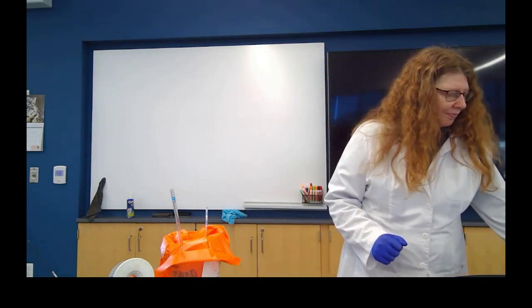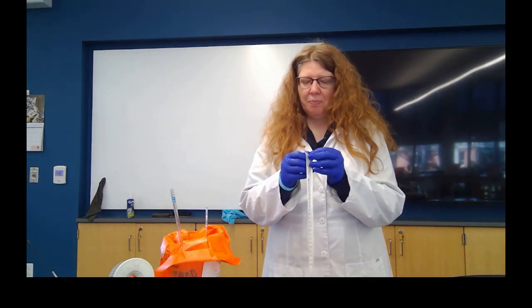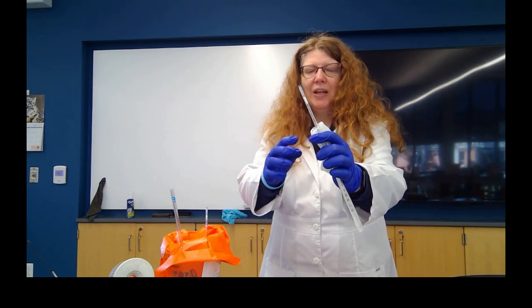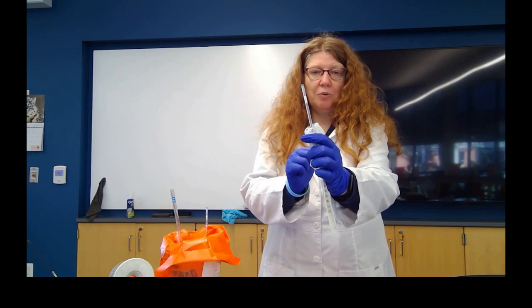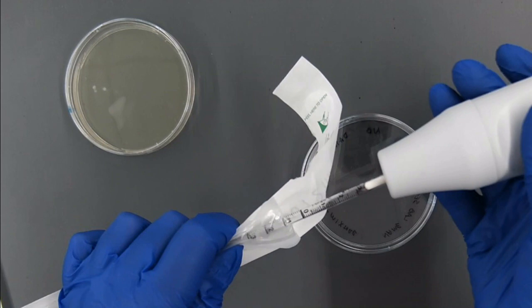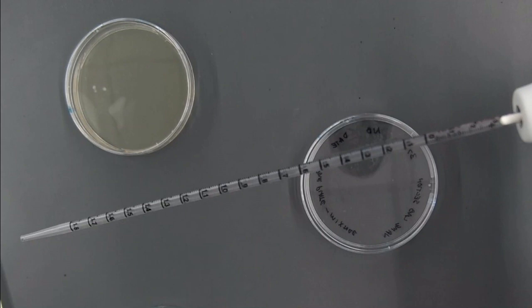I'm going to take my sterile pipette and I'm going to peel down the paper part way. Notice that there's cotton at the tip here, and these big lines. You'd never want to take the liquid up into the cotton because that will clog the pipette. I'm going to insert it firmly into the pipette bulb, and then withdraw the paper, and that goes into regular garbage.